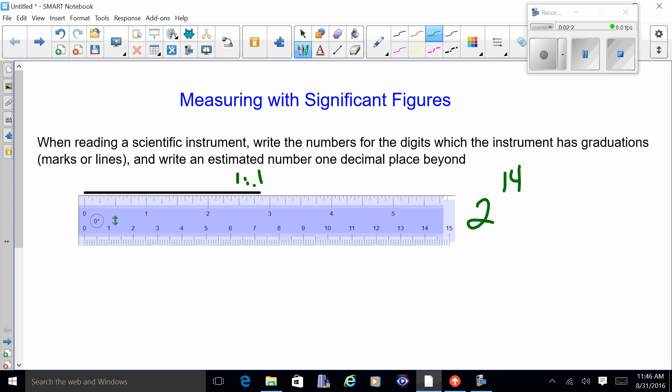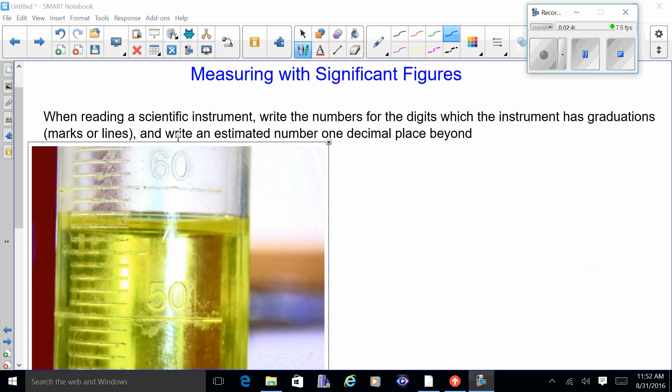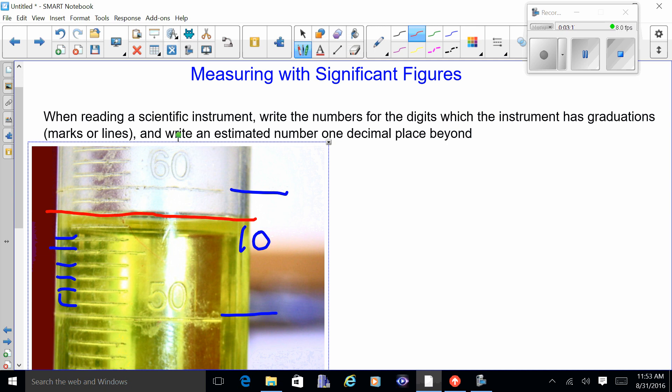Looking at this graduated cylinder, there's the 50 mark and the 60 mark, with 10 lines in between, so each line is worth one. That gives us 51, 52, 53, 54, 55, 56, 57, 58. The top of the water line climbs up the side of the cylinder — that's the meniscus — so you want to read the bottom of the meniscus. The bottom edge of the water is curved, and reading that bottom edge it looks like about 56, not quite up to 57.